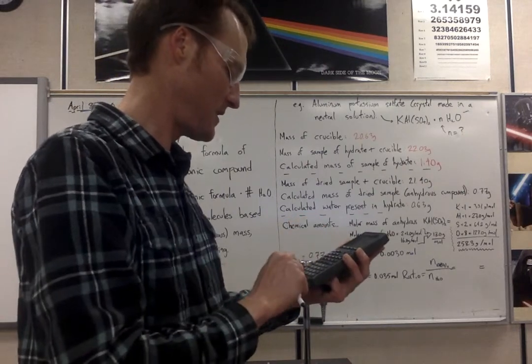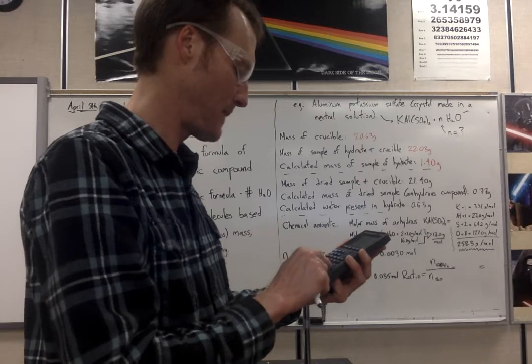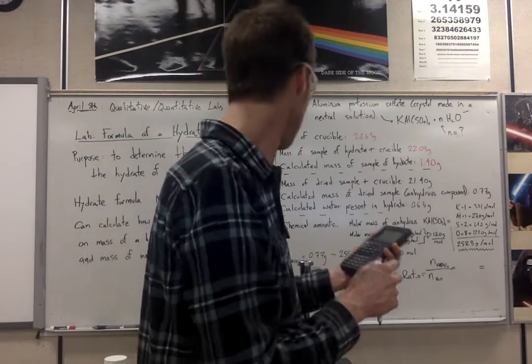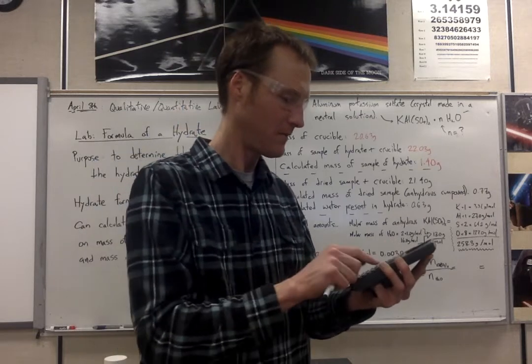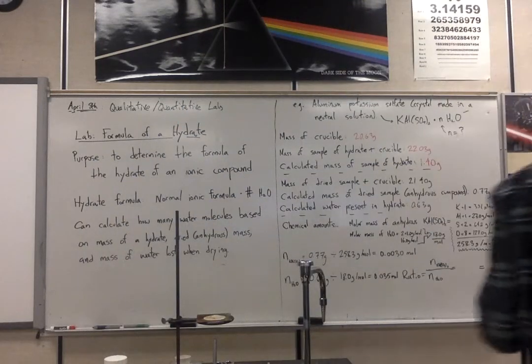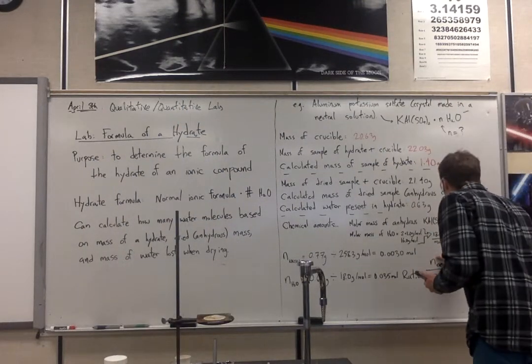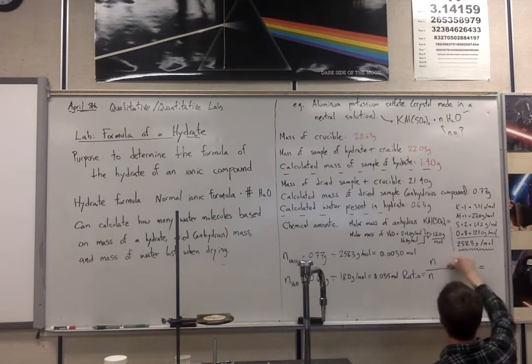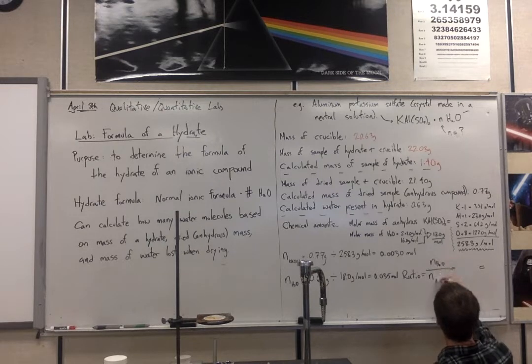All right, I'm going to try that again. 0.77 divided by 258.3. Oh no. It's got to be water over. Yeah.